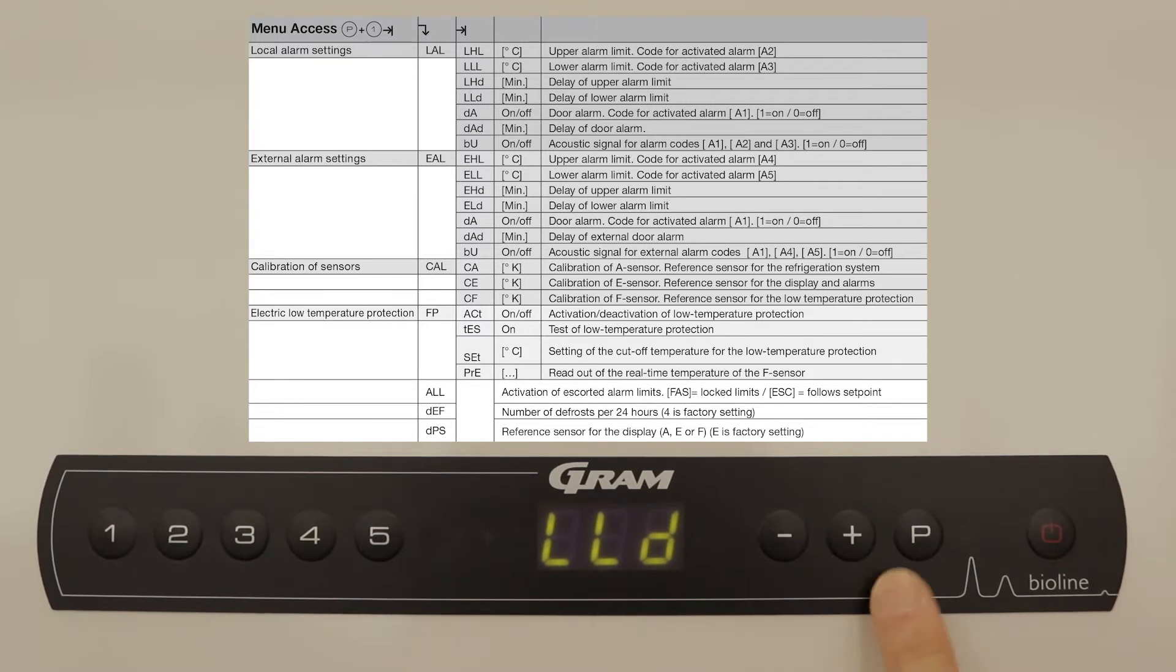Next is the delay of the low alarm limit. We will set this to 5, just like the delay of the upper alarm limit.